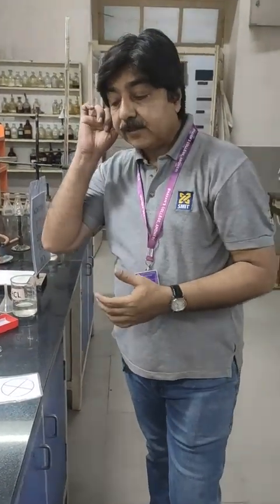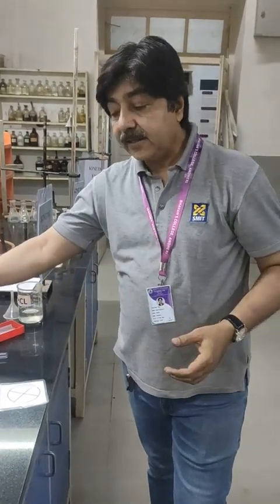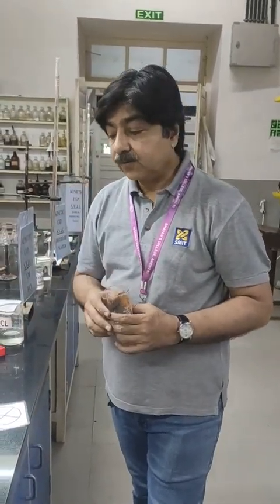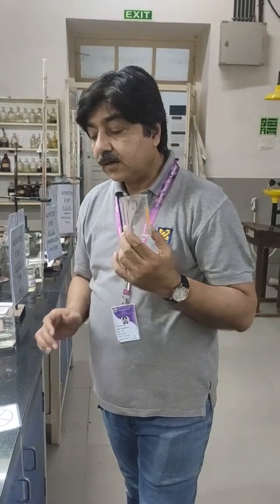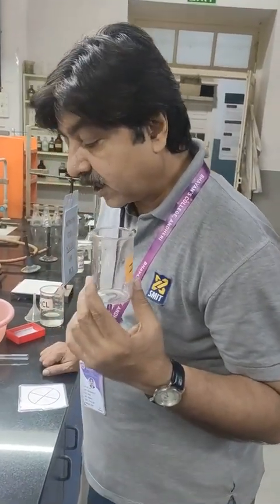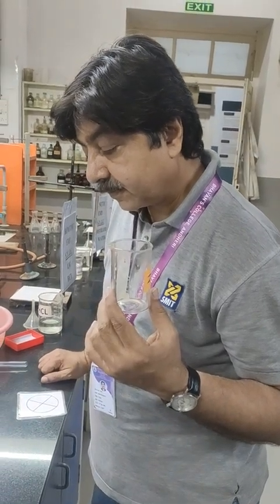Now in the same fashion, we will be taking the last set, that is set D of the reading, where I will be taking 50 ml of sodium thiosulfate. I will not add water, and to 50 ml of sodium thiosulfate I will add 2 ml of 1 molar HCl.